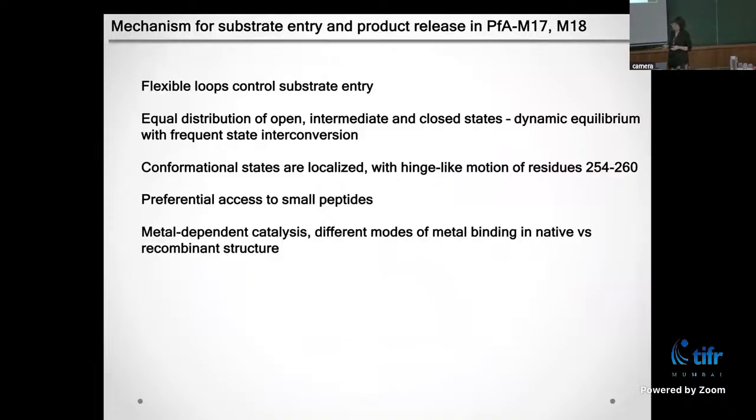Yeah, absolutely. But the moment we apply symmetry, then we end up with just the intermediate state, and I think that is the case with the crystal structure, where if the loop density is not, if you average it, then even if the densities were there, in some places they would get averaged out. But so you have individual particles. We have individual particles. Yes, definitely. Right.